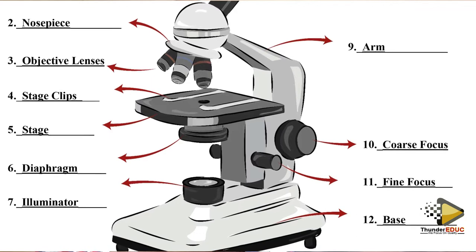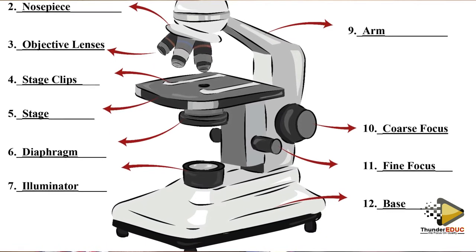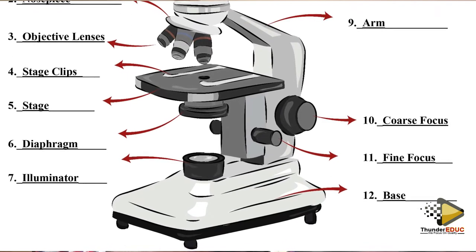Then scope means something related to vision. So you are viewing something which is very small. When you're using a microscope, you are trying to view something very small. You cannot see it with your naked eyes. Hence, microscope. Whenever you talk about micro, you mean things which you can't see.